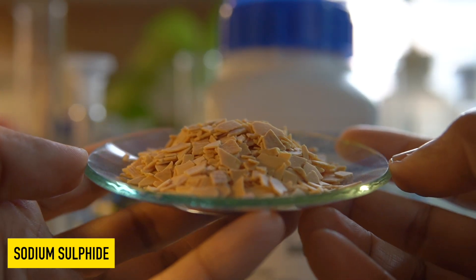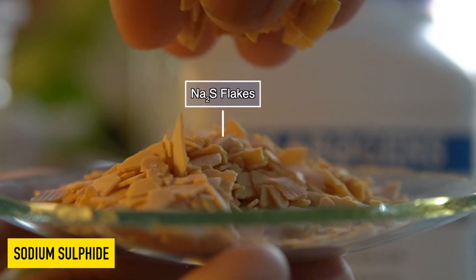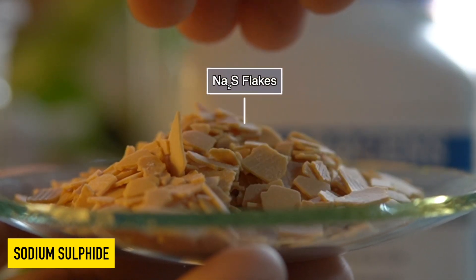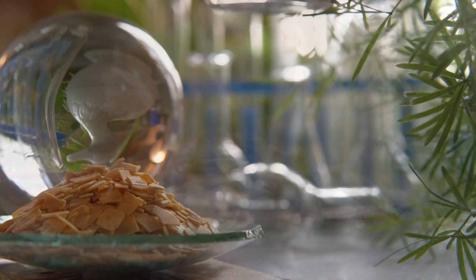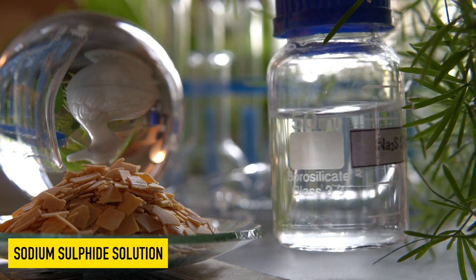These are sodium sulfide flakes. They are slightly yellowish in color and highly soluble in water. They can easily dissolve in water to make a clear, colorless solution.